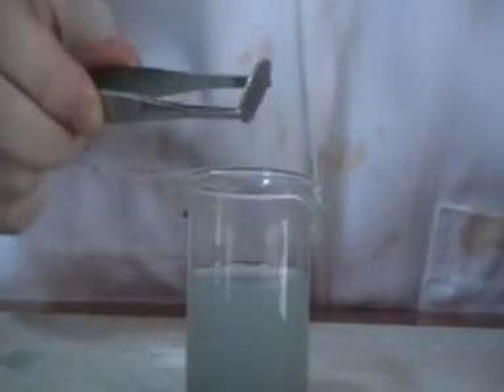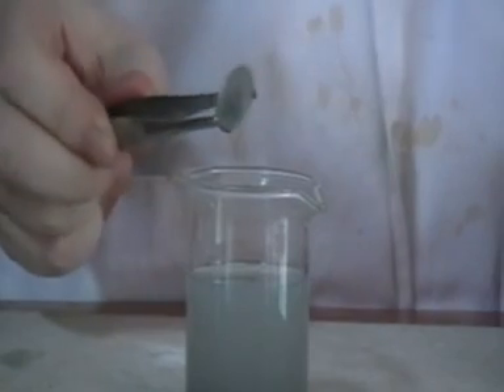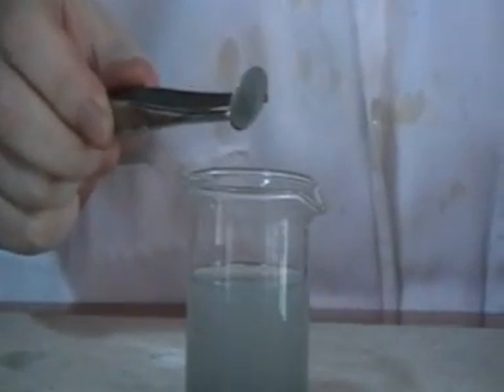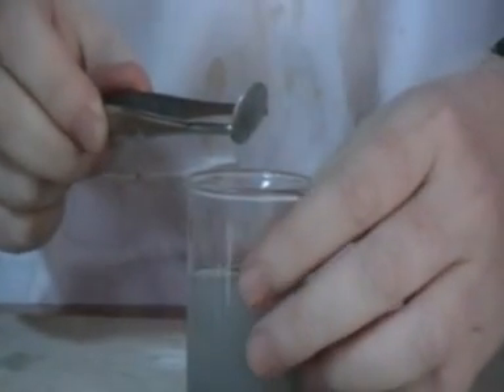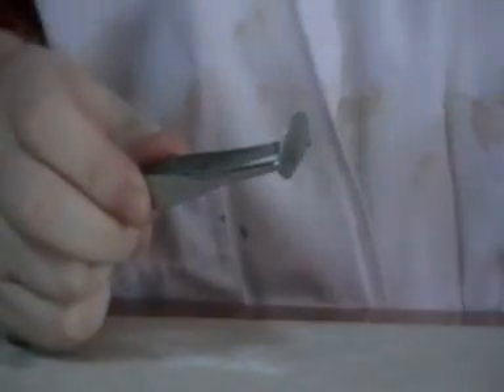The copper coin will look like this - it's not copper anymore, but it looks like silver. And then we have to wash it with water, dipping it into the water.